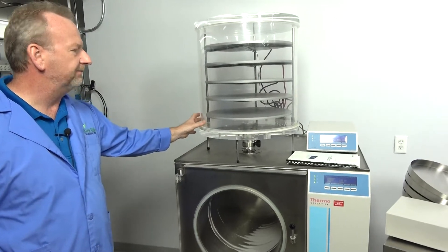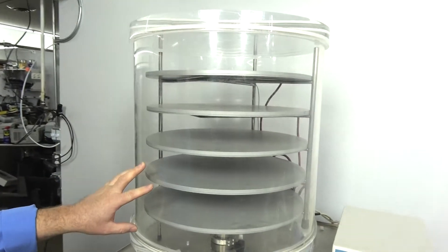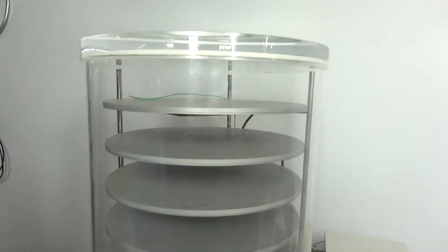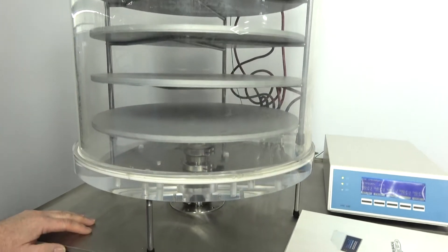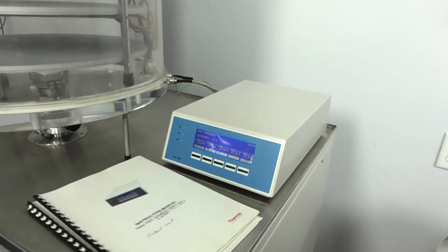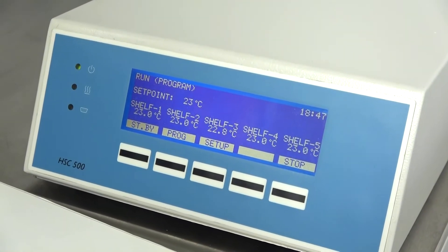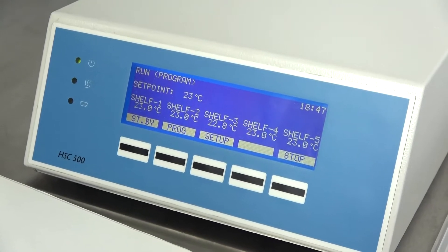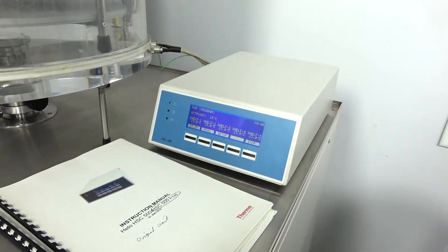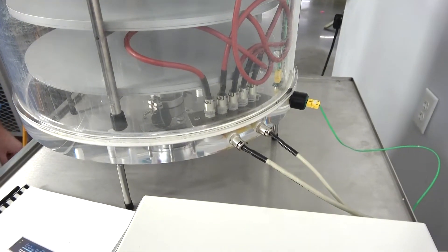This appears to be a customized drying chamber and you can see it has five shelves. Each shelf is actually heated and individually controlled. It has the controller over to our right which is giving all the shelf temperatures. You can go in and program each individual shelf for a specific temperature that you need to dry your product at, which makes it really versatile — you can have different types of products on each shelf and just set those temperatures.